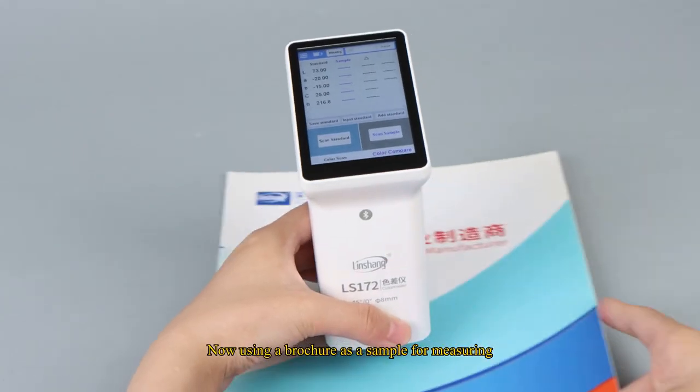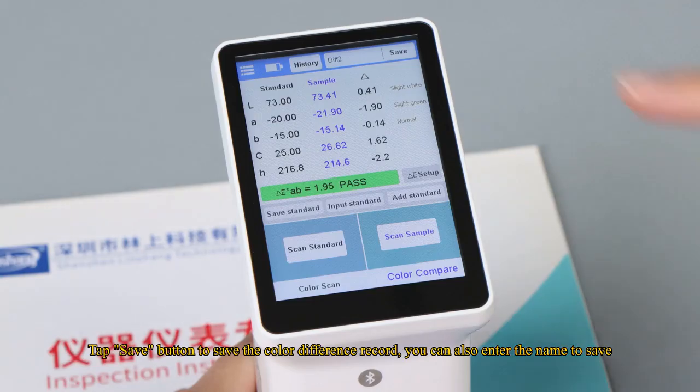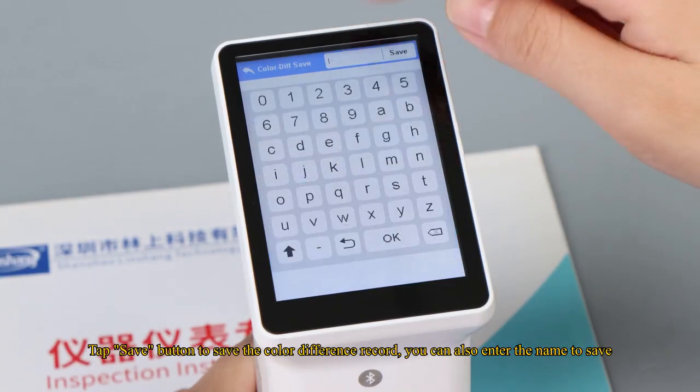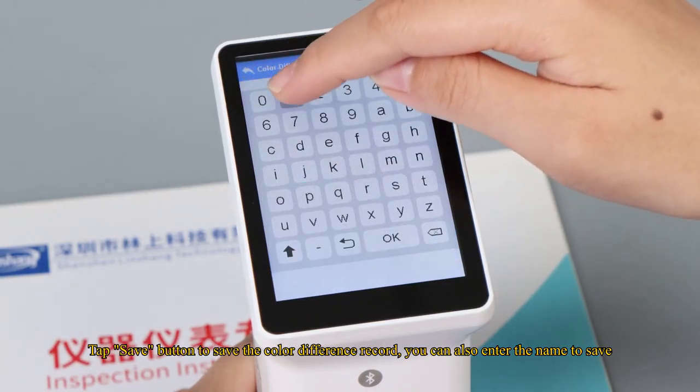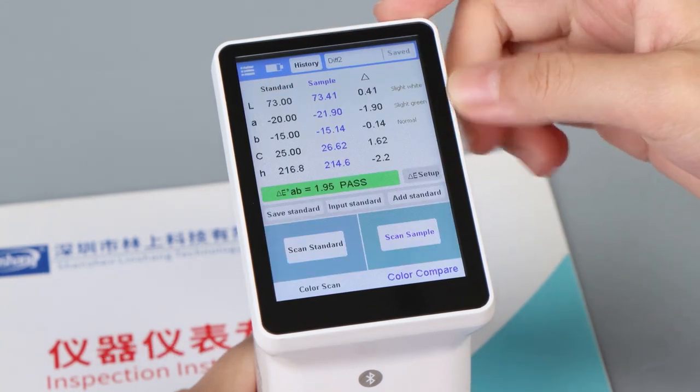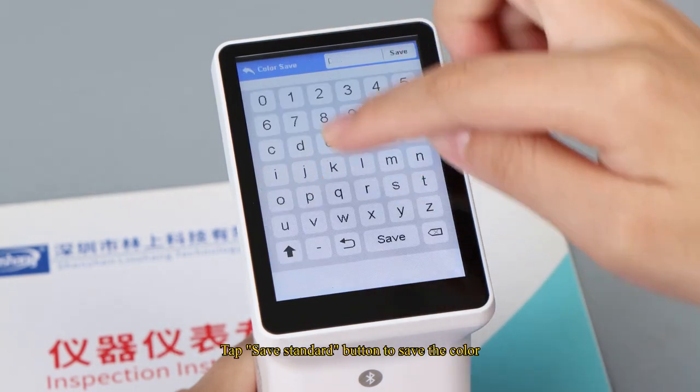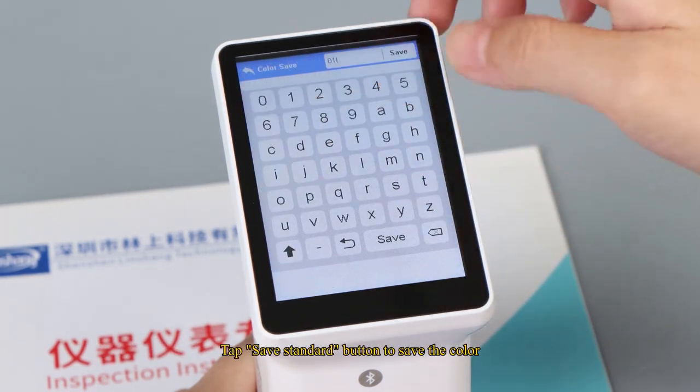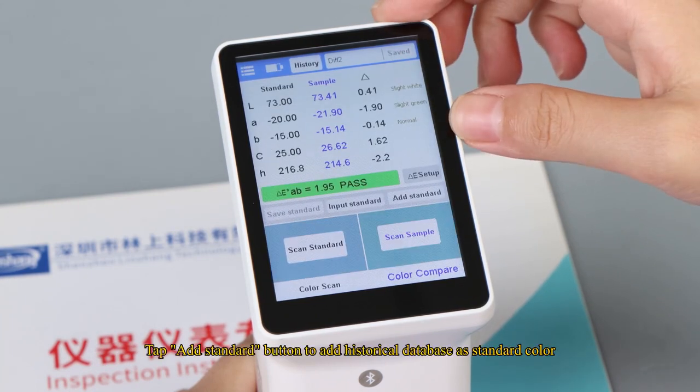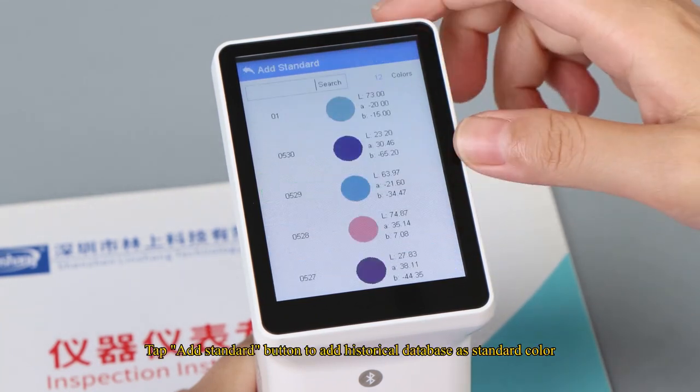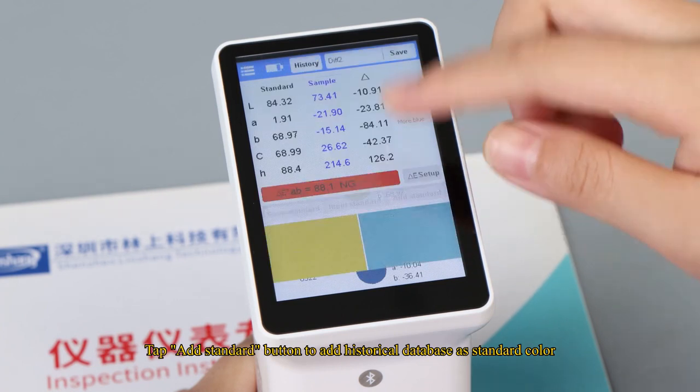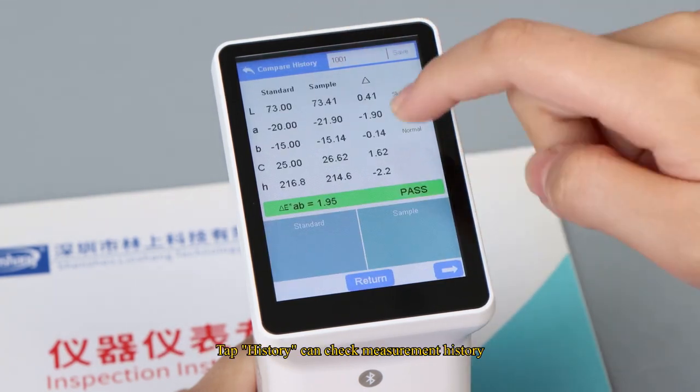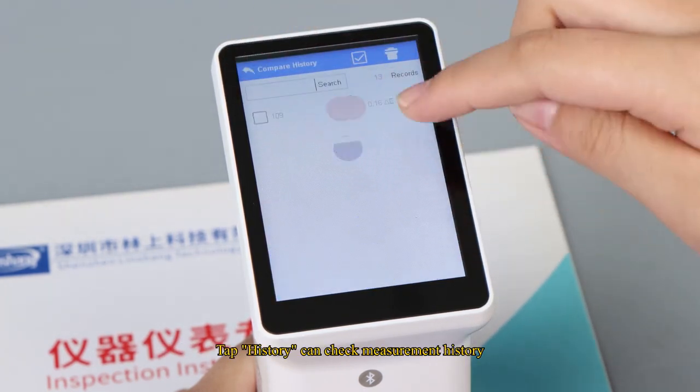Now using a brochure as a sample for measuring. Tap save button to save the color difference record. You can also enter the name to save. Tap save standard button to save the color. Tap add standard button to add historical database as standard color. Tap history can check measurement history.